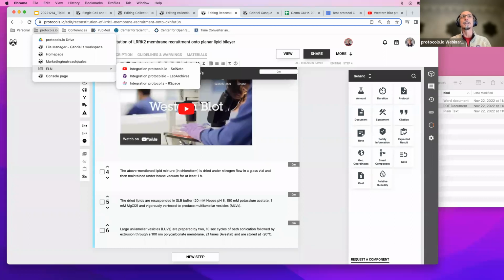If you want to create a new version of a protocol that you didn't originally create, you have to request permission from the original authors for your protocol to be version 2 or 3 of their protocol. But you can fork a protocol without requesting author permission to create your own optimized version.